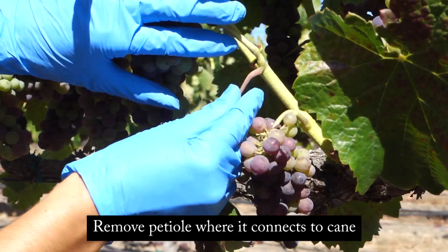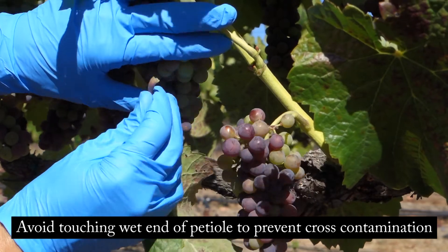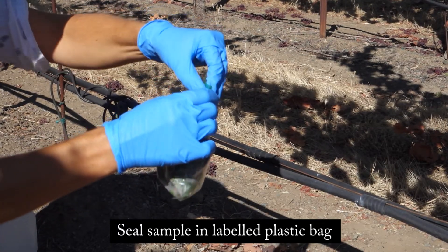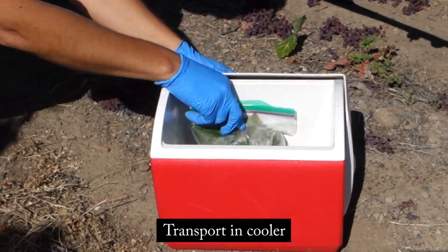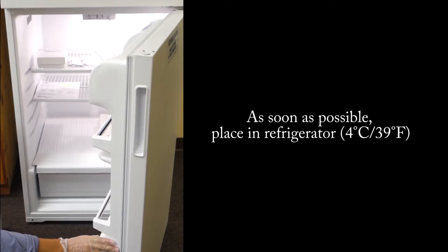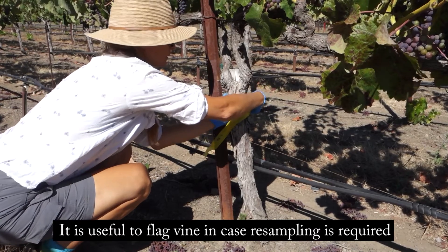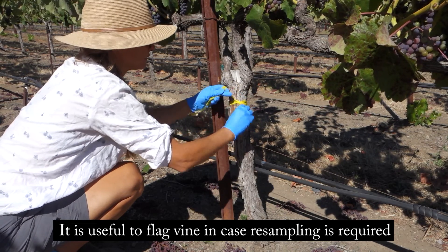Remove the petiole where it connects to the cane and avoid touching the wet end of the petiole to prevent cross-contamination. Seal the sample in a labeled plastic bag and transport in a cooler. As soon as possible, place the samples in the refrigerator. It is useful to flag the vine that you sampled from in case resampling is required.